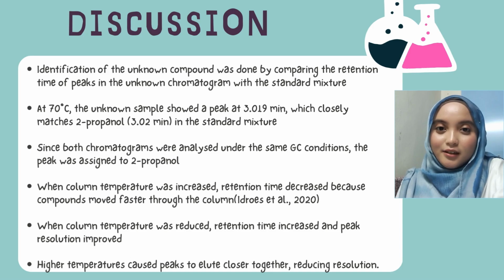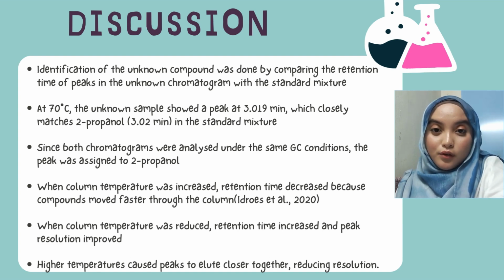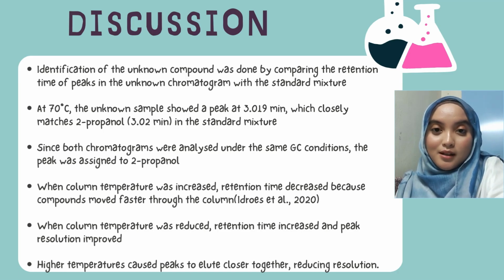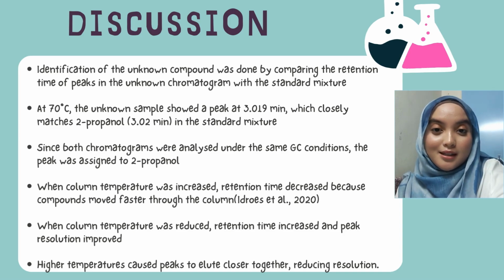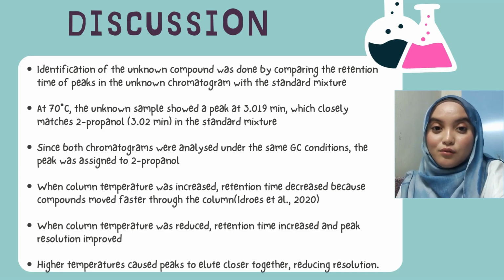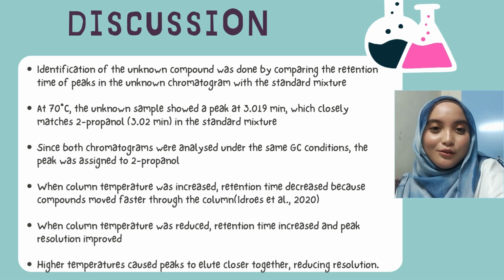For this discussion, to determine which peak in the unknown chromatogram corresponds to each compound in the standard mixture, retention times were compared under the same GC conditions. So in this experiment at 70 degrees Celsius, the unknown sample showed a peak at 3.019 minutes, which is very close to the retention time of 2-propanol in the standard mixture, which is about 3.02 minutes. Since the retention times are almost identical and the analysis was performed under the same conditions, the peak in the unknown chromatogram was assigned to 2-propanol.